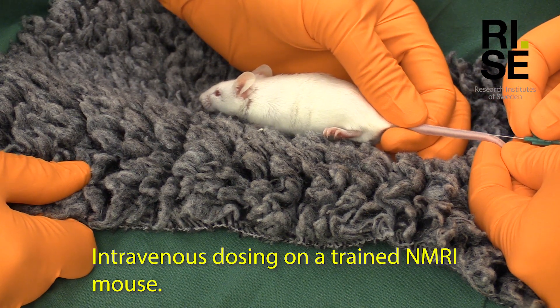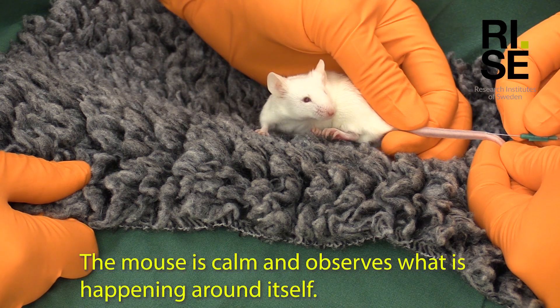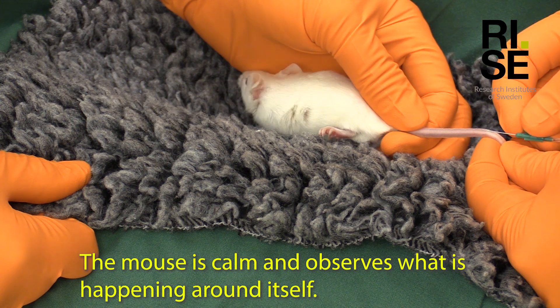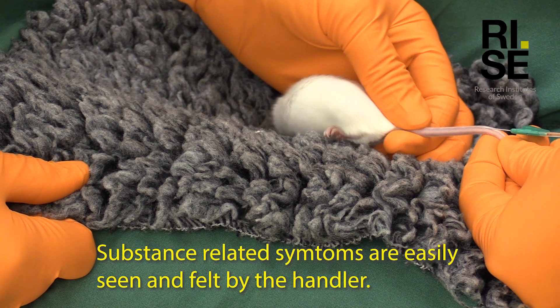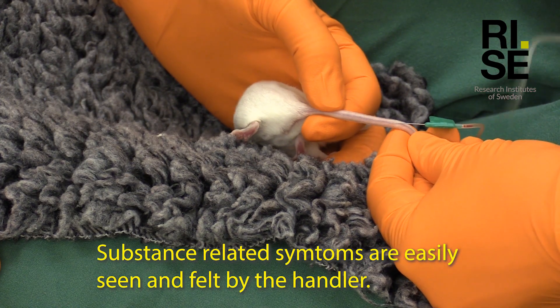Intravenous dosing on a trained NMRI mouse. The mouse is calm and observes what is happening around itself. Substance related symptoms are easily seen and felt by the handler.